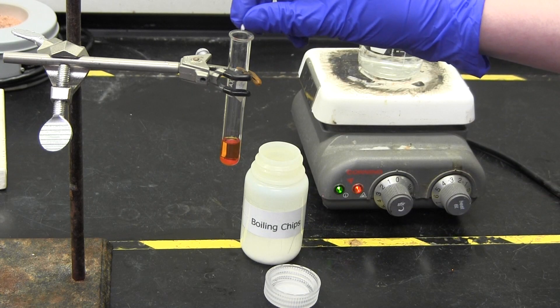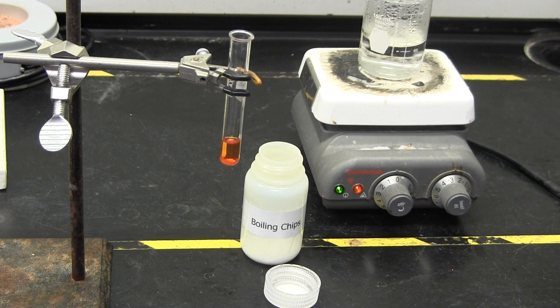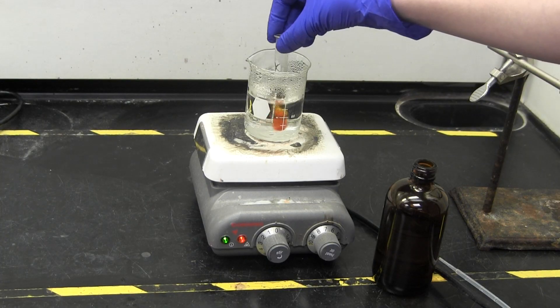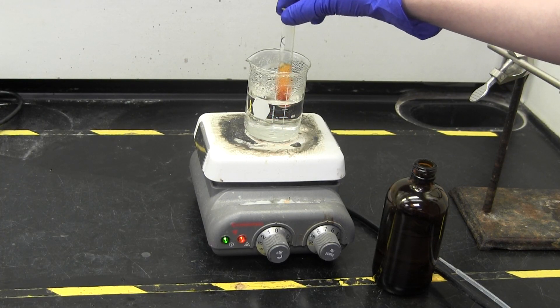Then you will put your solvent and unknown into the test tube and place it in the hot water bath. Add a boiling chip directly to the solution. Swirl the test tube and heat until the unknown fully dissolves.